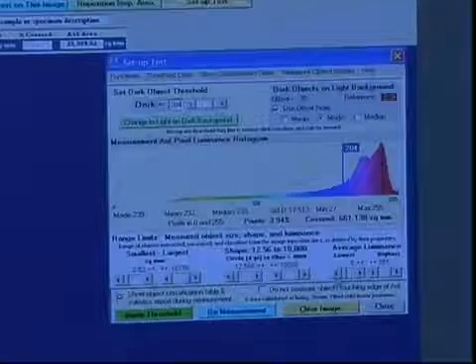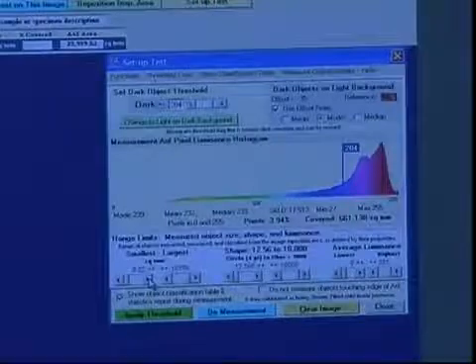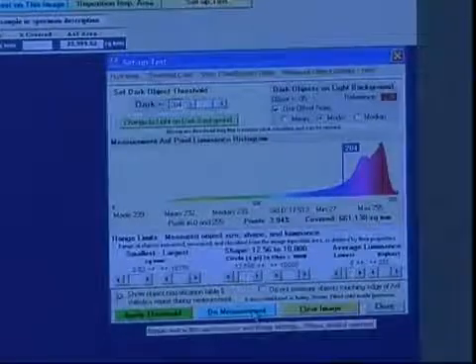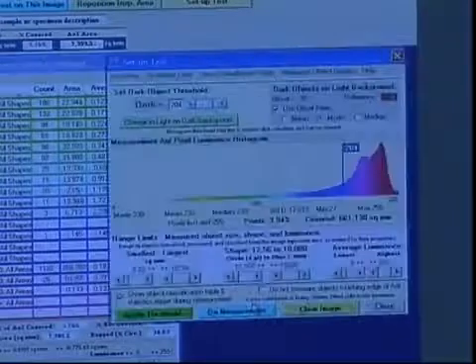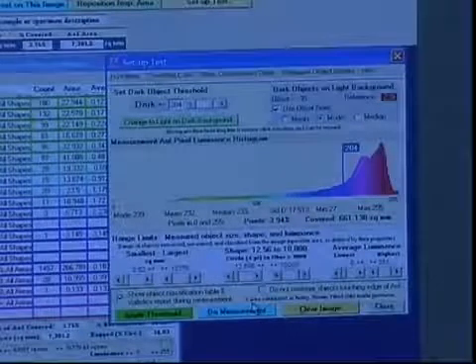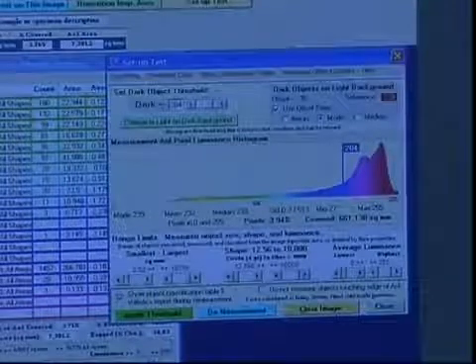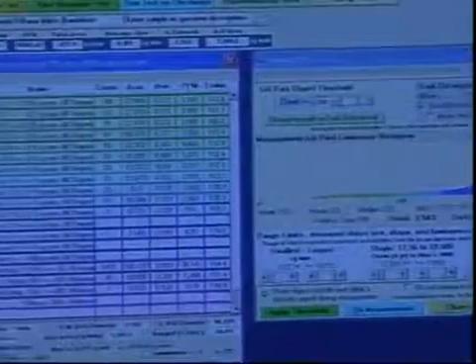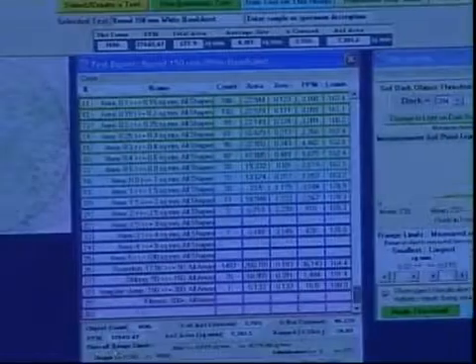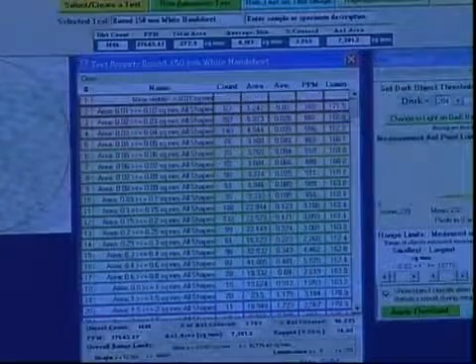We have done all the settings. We're filtering out everything that is less than 0.02, but I can tell you that this hand sheet is very busy, and we'll make the calculation anyway. It's kind of typical of what may come out of the pulper, but you can see that we counted 1,486 dirt particles in that small area of the hand sheet. Very busy. The ppm is out of sight. It's 37,000 and some. Each one of the specs is classified into categories.